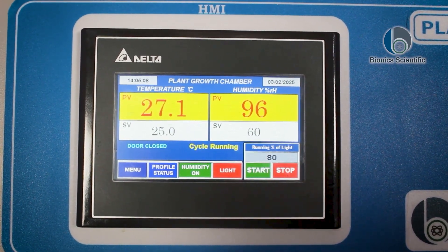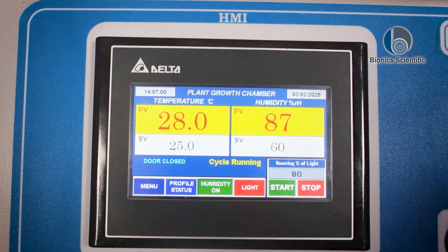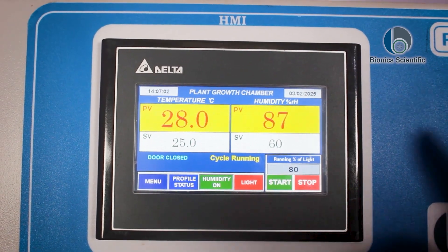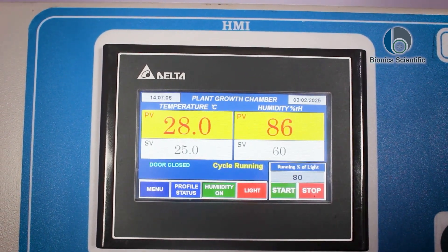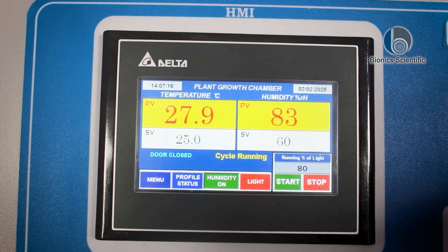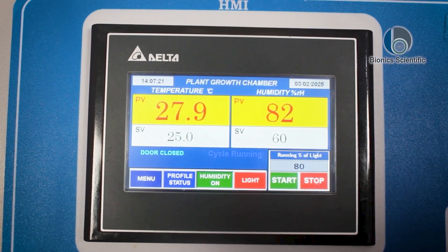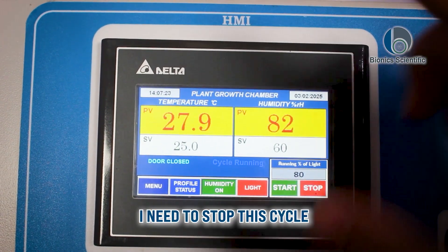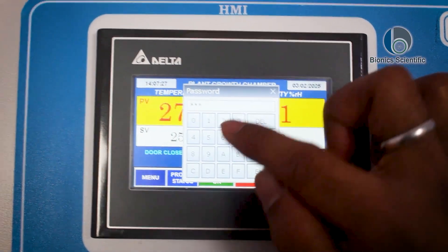You can hear the sound as well. I have set my temperature to 25 degrees Celsius. Now I want to set the humidity as well. There are two ways to do this, but just to demonstrate it more clearly, I'll show it again. I need to stop the cycle — stop — enter password one, two, three, four.